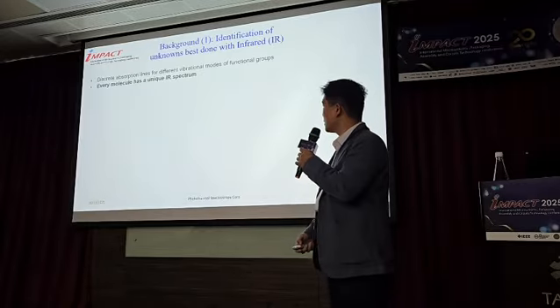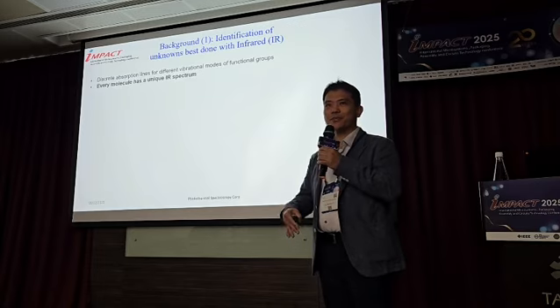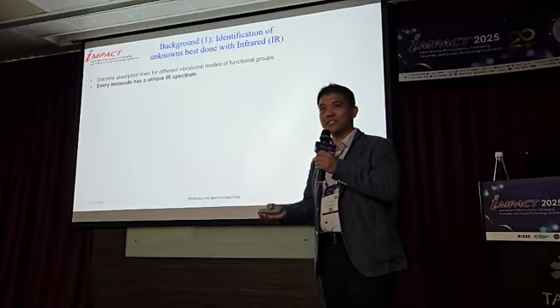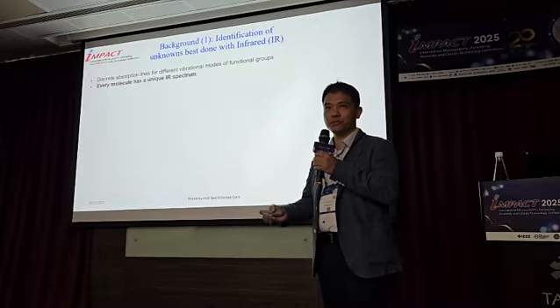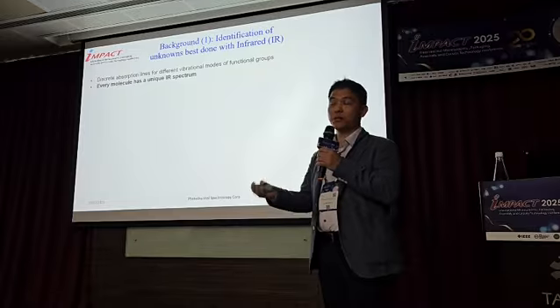All right. Okay, so it goes back to the basics where we have, let's say, molecules. For us to identify what it is, we go back to using infrared, because infrared spectroscopy gives us the functional groups and the connectivity between the atoms that SEM couldn't.